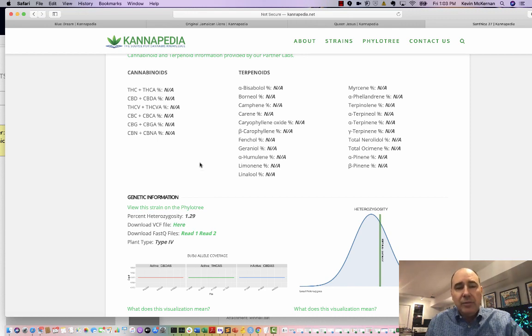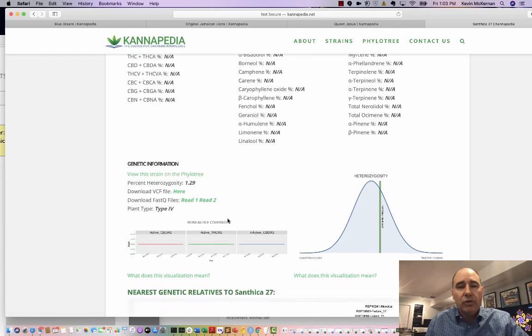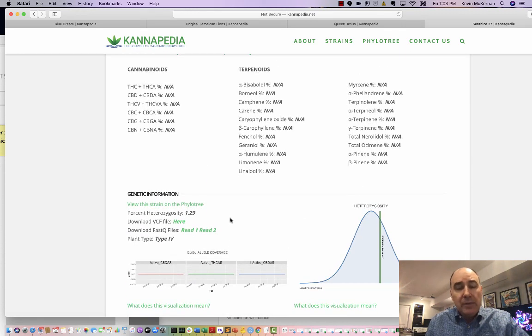And that is largely believed right now, although it is hypothesis, to be coming from cannabichromene. Cannabichromene is the next closest relative to these 2 other synthase genes, which is why we're soon going to put a little cannabichromene synthase gene coverage map over here so you can chart that as well. The current Strainseek panel does in fact sequence cannabichromene synthases. There's 8 of those genes in the genome, so we look at the coverage at all 8. We do cover all 8, and you can find that in this VCF file here.